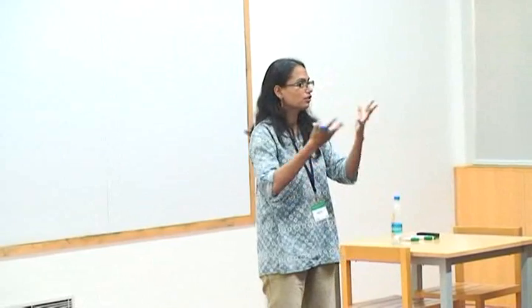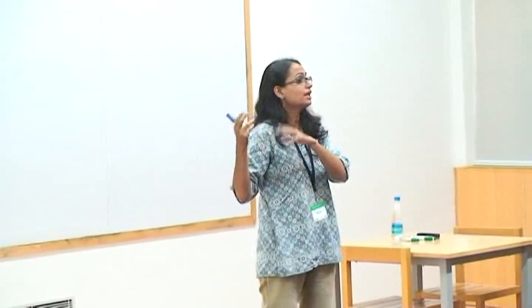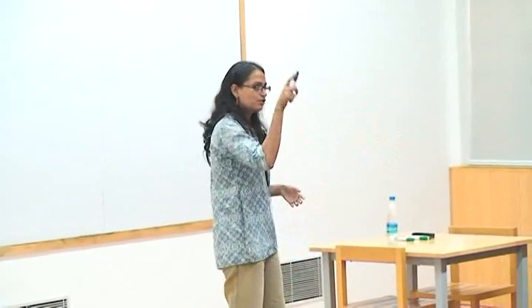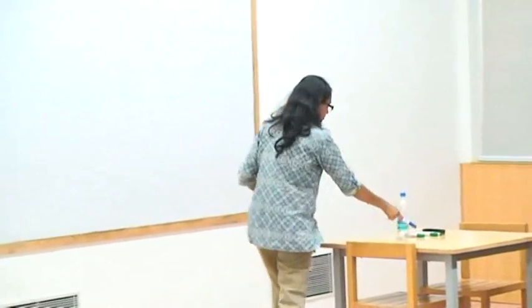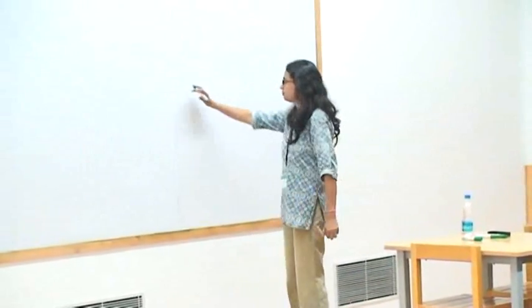So that's a very good point. And again, this is something that we can use. At one point we thought we could use the cracks as patterns. Of course, you can do micropatterning, but in the absence of it, you can use this to create patterns. So again, to talk about ligand concentration, there's another thing you can play with to have a surface which has a gradient of ligand concentration.